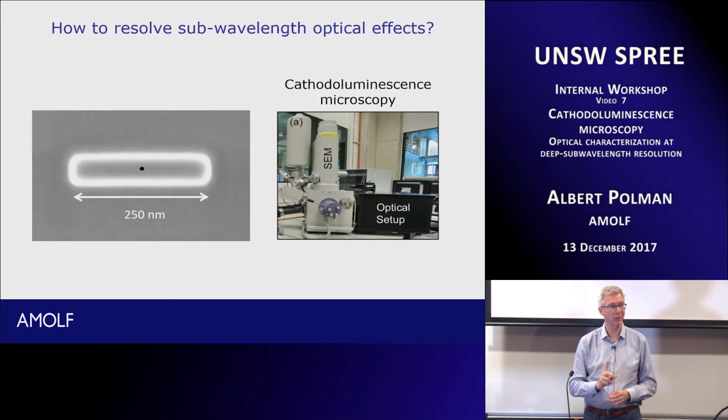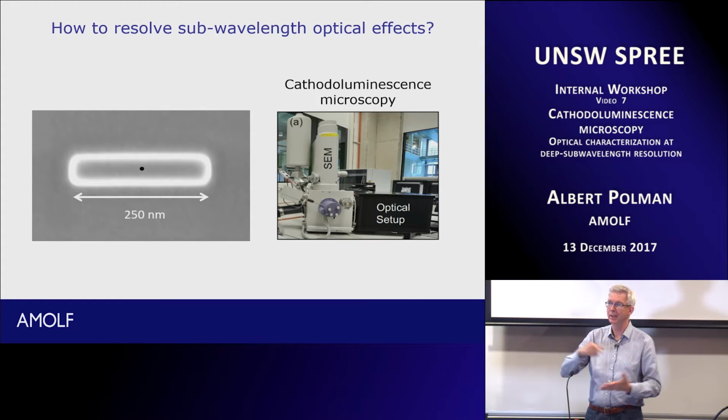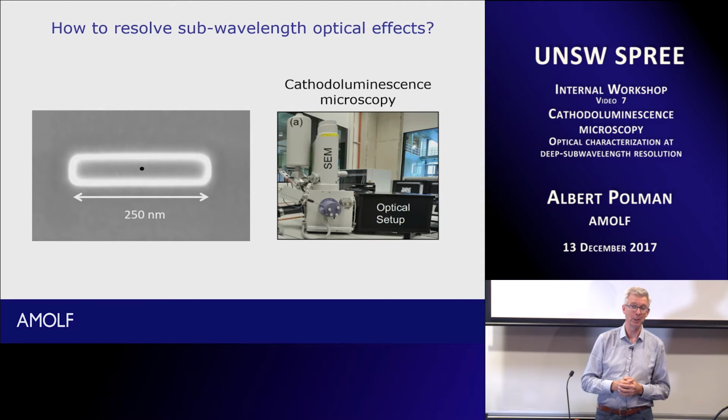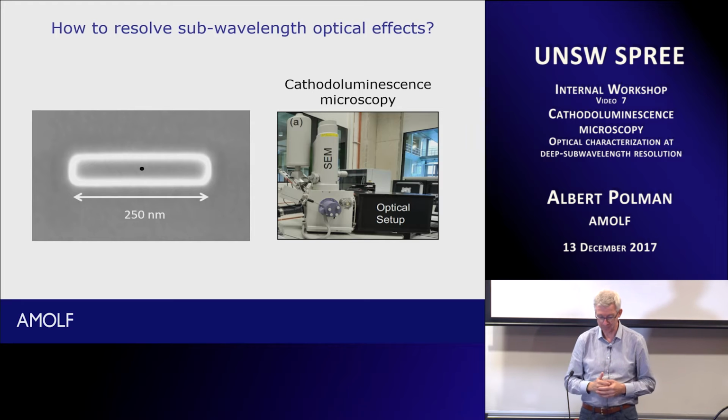But then wait, we were talking about optical imaging, right? And an electron image in an SEM, what that is: the electron beam scans, and then the secondary electrons that are created by this primary electron are detected, and they form the image, right? No optics. And what I'm going to show you now in this talk is that actually the electron beam can also make optics, can make light come out. And that's called cathodoluminescence. So the electron beam will scan over the surface, and at every pixel, at every position where the electron beam is, we're now going to study what is the light that is emitted.